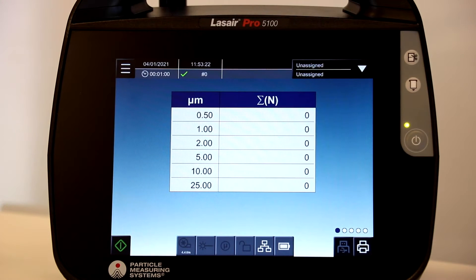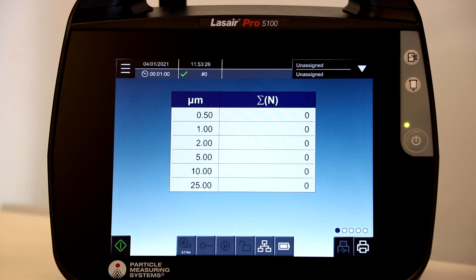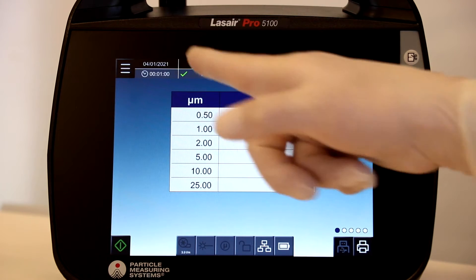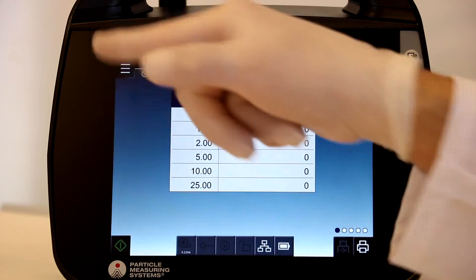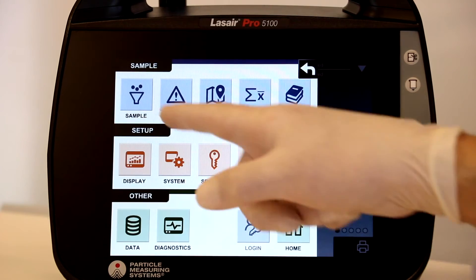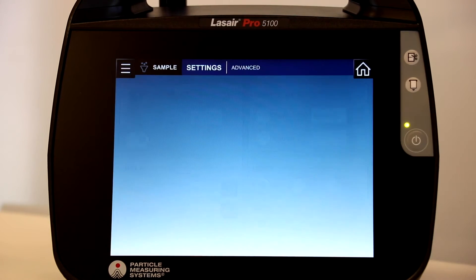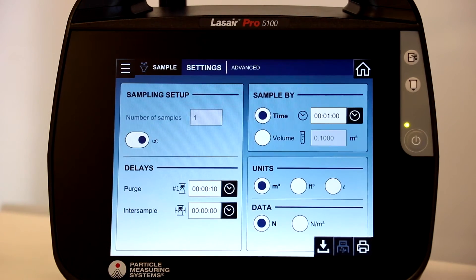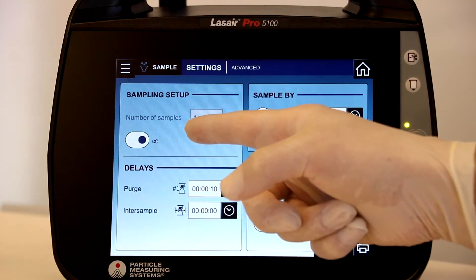To create a recipe, you will first select the navigation panel and then select the Sample Setup screen. Here, you can select your sample parameters, such as number of samples or infinite sampling.